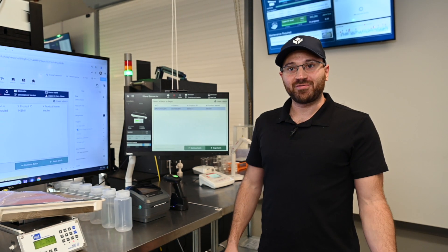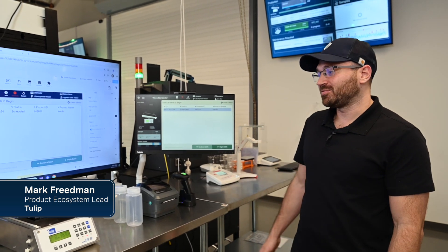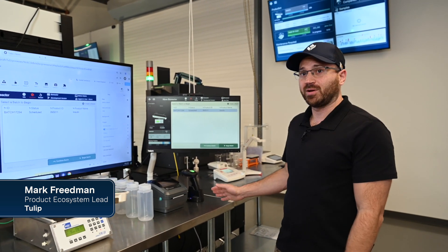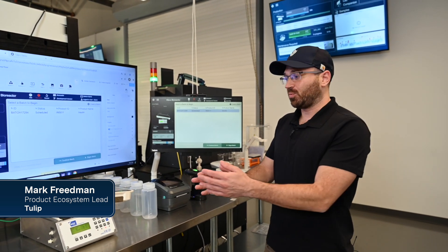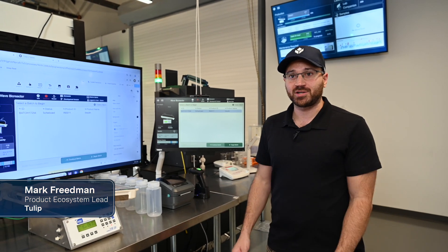Hey everybody, I'm Mark Friedman. Welcome to the Tulip Experience Center. I'm going to show you a demo that uses a wave bioreactor integrated with Tulip to walk a user through large molecule production.